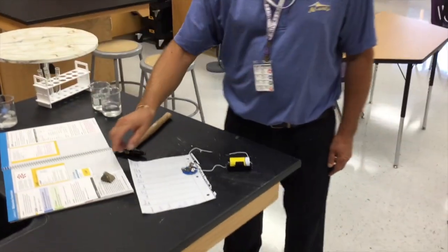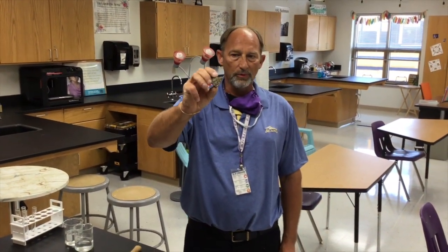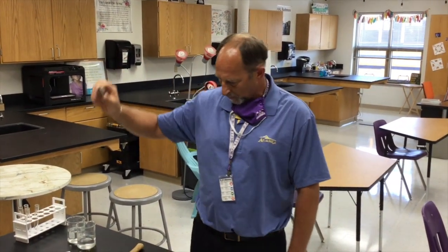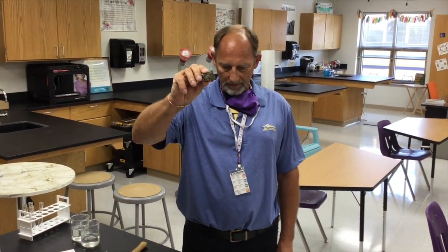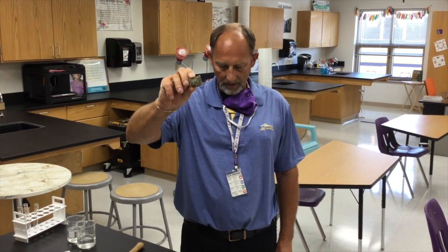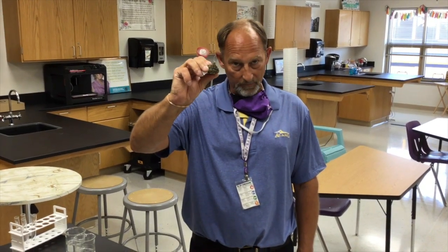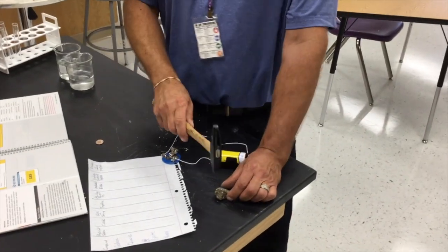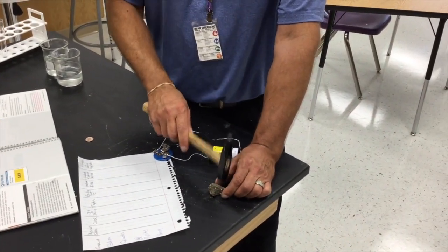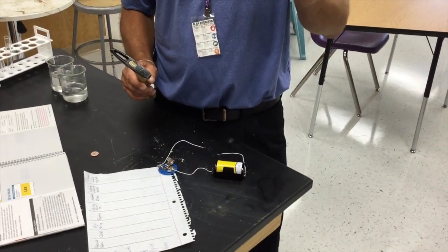Our third compound, pyrite. Maybe you guys hear fool's gold, okay? Fool's gold. So we go through our data table, our physical state, color, dull or shiny, texture. Pretty sure you guys can figure that out. Boiling points, we will research a little later. Okay. Is pyrite malleable or brittle? And again, I'm not going to break it all up, but you can see it already being broken. It is quite brittle.